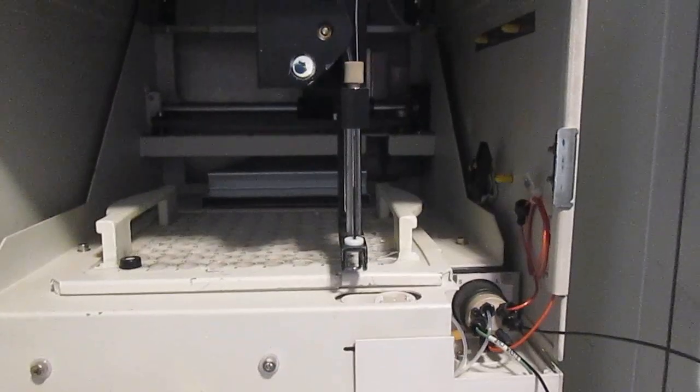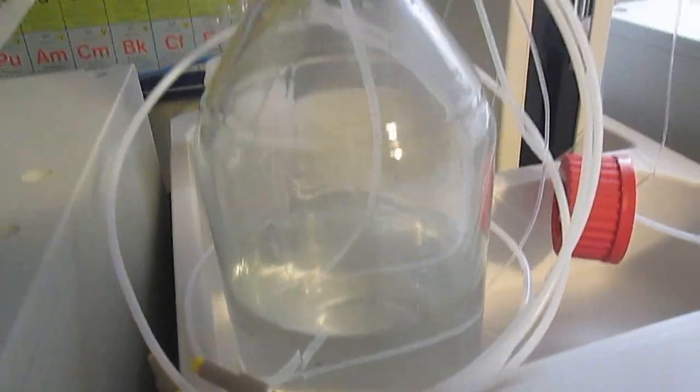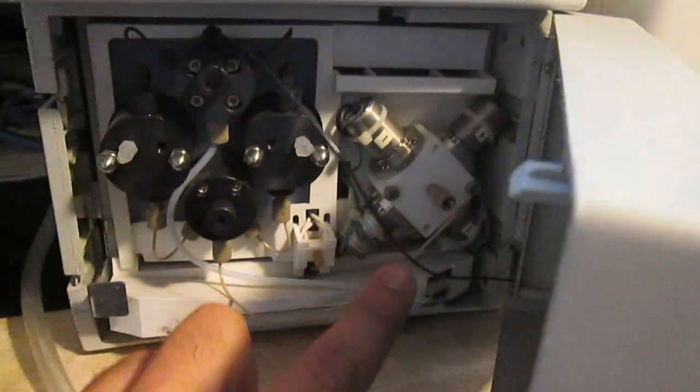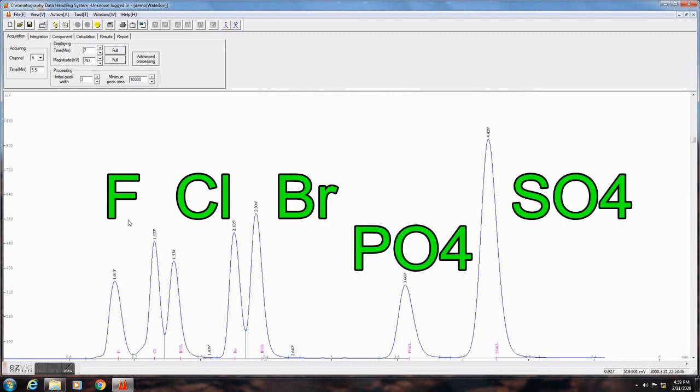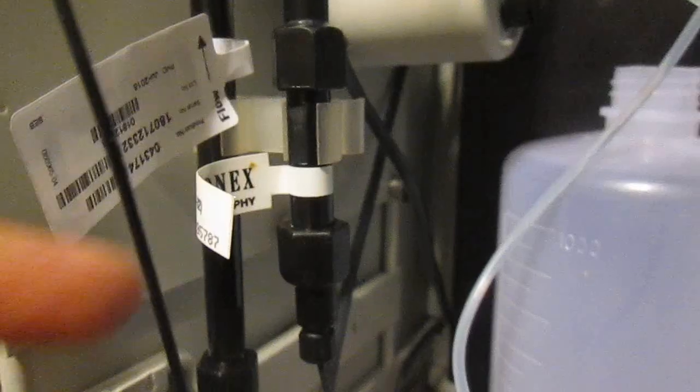The solution to be analyzed is carried by a mobile phase, pushed by a pump through the column, and each of its components come out the other side at a different retention time and are picked up by the detector, in this case a conductivity detector.